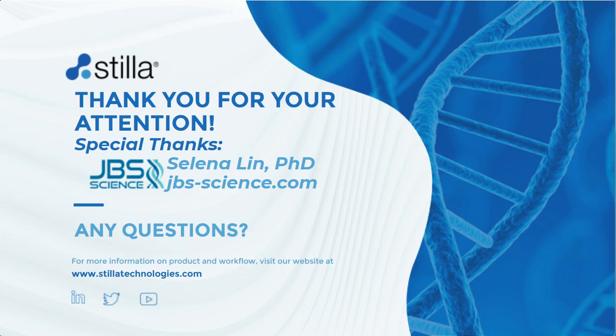Okay, thank you. Dr. Wendlandt, are there other options for allelic discrimination assays other than the Affinity Plus probes? Yeah, there is. Affinity Plus is our go-to for allelic discrimination just due to the customization and the flexibility of the probes. We're able to offer an MGB probe through our GMP lines and soon as an RUO product. So MGB probes are also available. There are some other technologies that are available, but they're not going to be compatible with multiplexing.